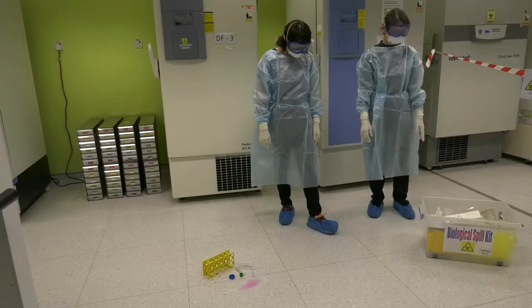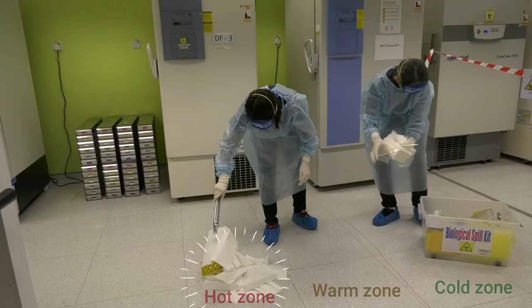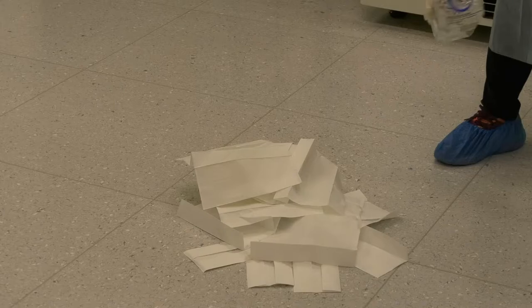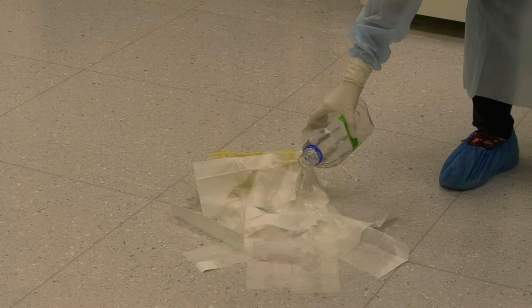Spill cleanup procedure. Demark the floor to indicate the spill area. Surround and cover the spill with overlapped absorbent paper. Carefully pour sufficiently freshly prepared disinfectant onto the absorbent paper to wet it. Pour near to the spill to avoid splashes and aerosols, working from outside to the centre of the spill. Wait for 30 minutes contact time.